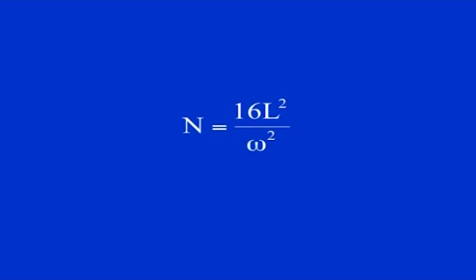Now if we consider the position for a peak emerging from the column, so that x equals L, and from the knowledge of the fact that the width of the peak at its base, obtained from tangents drawn from the two steepest parts of the peak, equals 4 sigma. Hence, sigma equals 1/4 of the base width, and so you can convert the previous equation to: number of theoretical plates equals 16 L square upon the base width square.